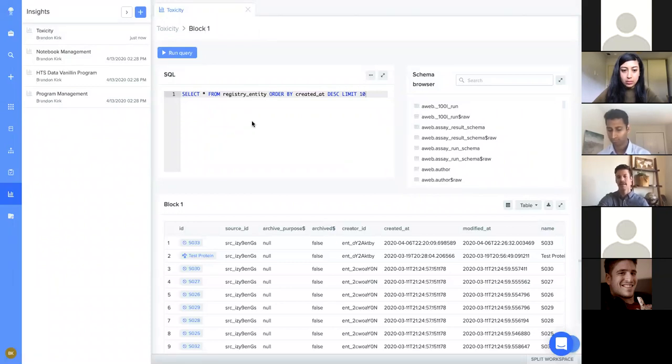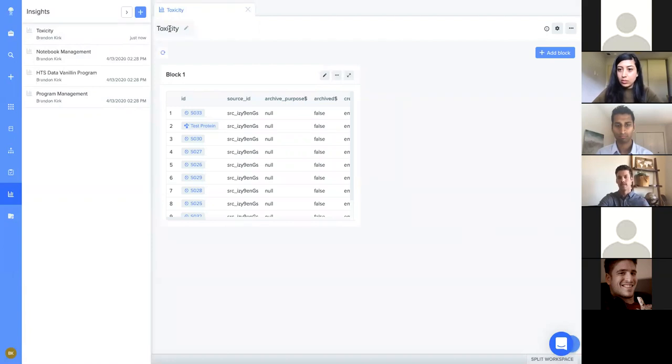So just to give you a step back in terms of what we were looking at previously in the demonstration and what we're looking at now here in the configuration, the view that we were looking at in the demonstration was the dashboard level view, where we had several blocks. Some of them had 2 or 3 blocks. Some of them had as many as 4. So in this case, we're configuring a dashboard, and we have been navigated to the first block of that dashboard. To go back into editing the dashboard, I can use this pencil, and that will take me back to the view that I was in when I first created the dashboard.